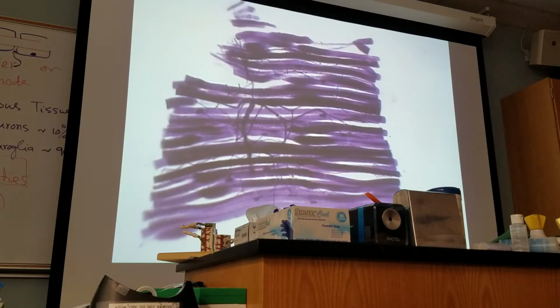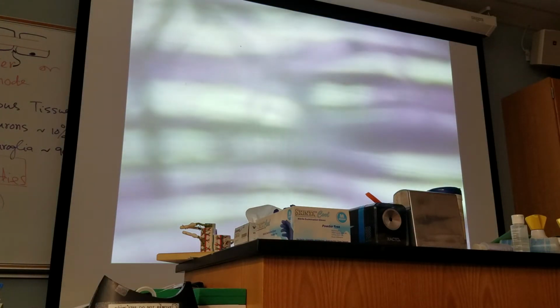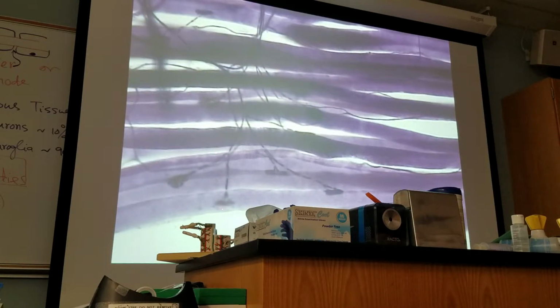Let's go to a little higher magnification. The synaptic end bulbs. This is out of focus. Okay, now in focus.